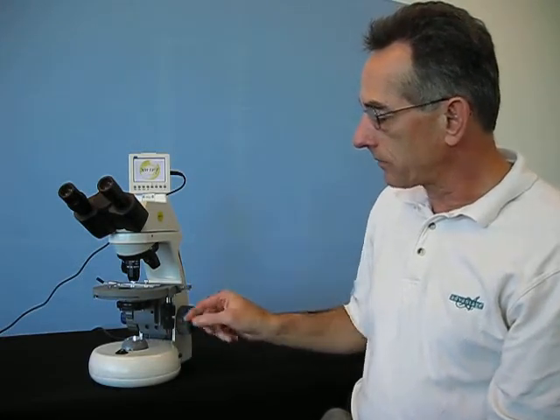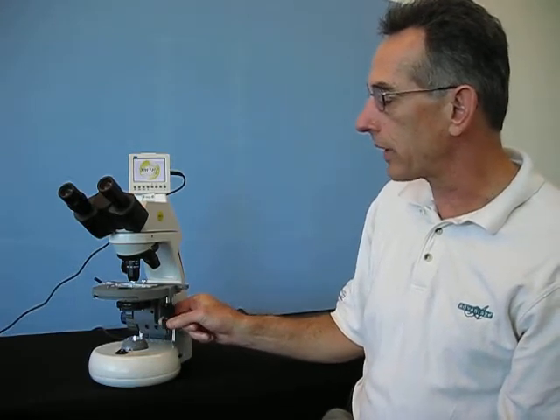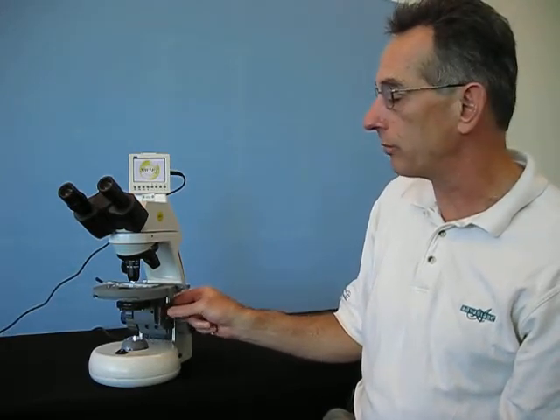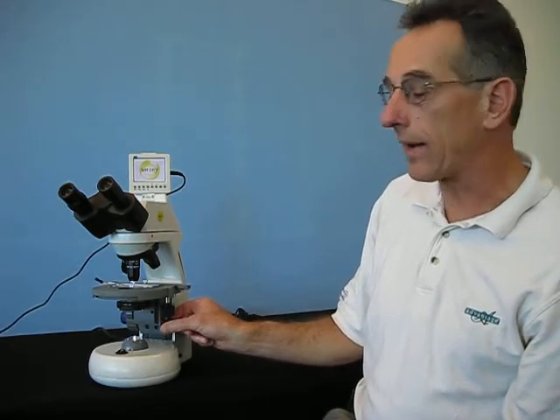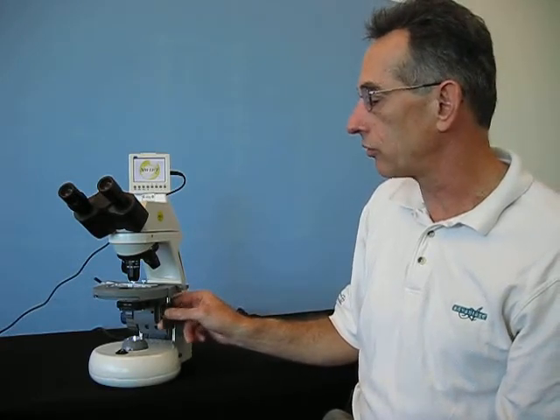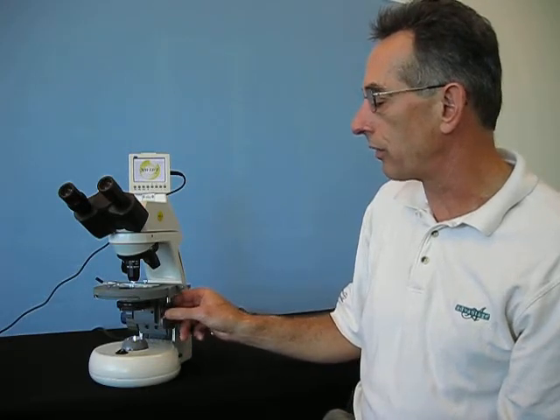Moving on down, on the right-hand side you have the controls for the mechanical stage. The top knob controls the x-axis, or the front-back movement. The bottom knob controls the left-right, or y-axis. You can learn to intuitively know which knob to use as you're trying to scan a particular slide to see what's there and visible.